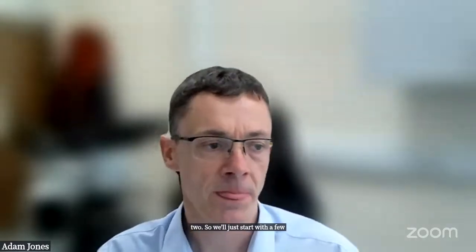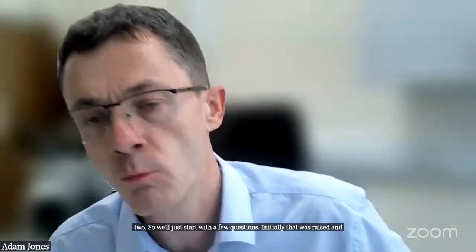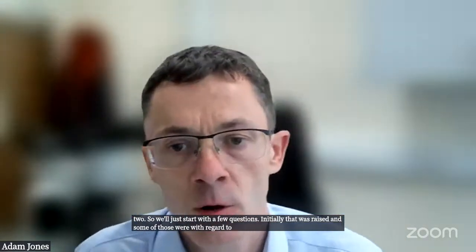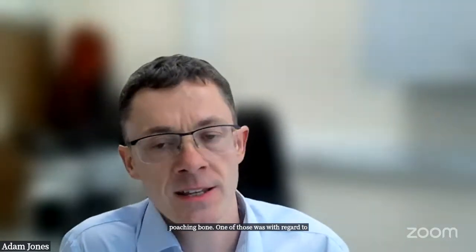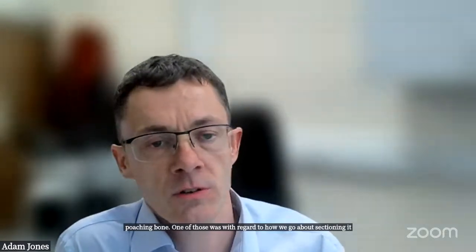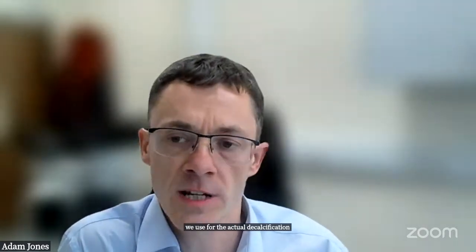So we'll just start with a few questions initially that were raised, and some of those were with regard to bone and how we approach bone. One of those was with regard to how we go about sectioning it, but then also what we use for the actual decalcification process. Some of those, of course, are relevant to the larynx as well.